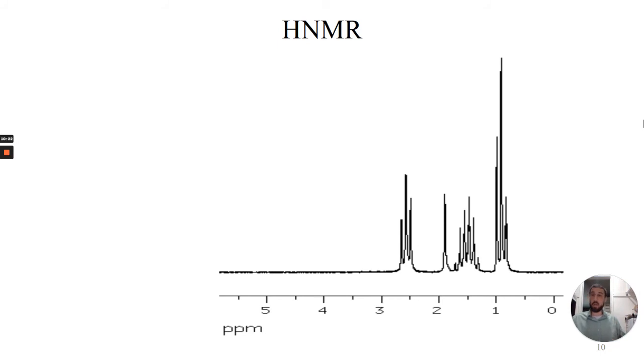Last one, HNMR, same deal. We'll give you another 30 seconds. Probably mean because HNMR takes the longest, but tough.